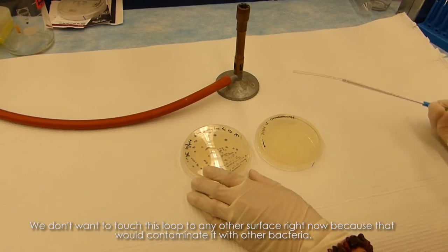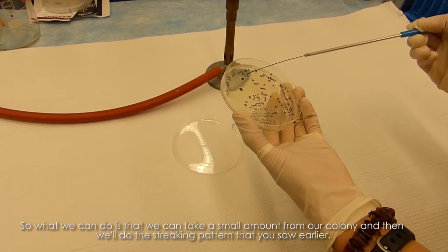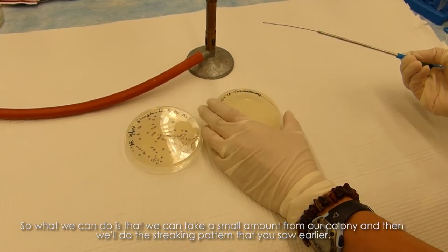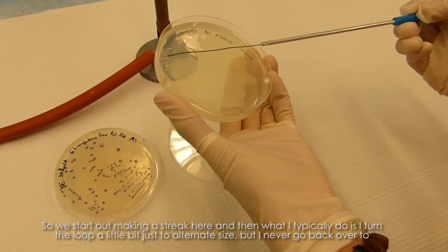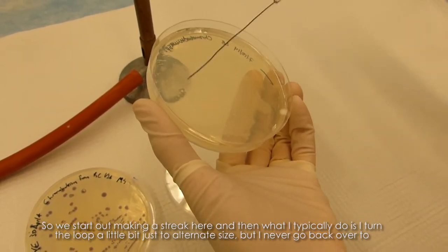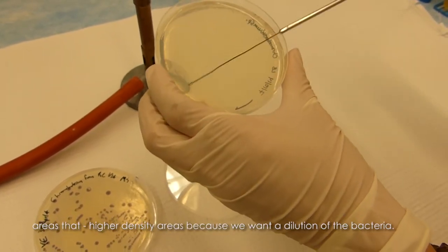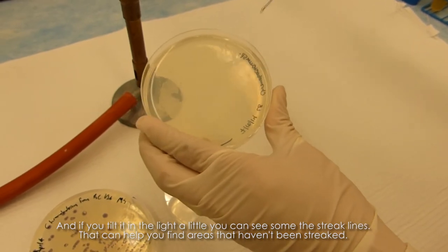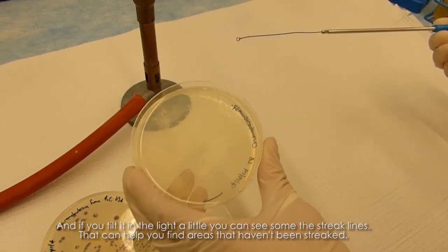We don't want to touch this loop to any other surface right now, because that would contaminate it with other bacteria. We take a small amount from a colony and then do the streaking pattern shown earlier. We start by making a streak here, and then I typically turn the loop a little bit to alternate sides, but I never go back over higher-density areas because we want a dilution of the bacteria. If you tilt the plate in the light, you can sometimes see the streak lines, which helps you find areas that haven't yet been streaked.